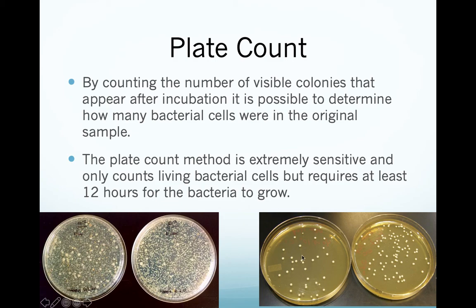So eventually you just do the back steps of math to figure out how many were in your original liter sample. This takes forever. It's a very easy way to mess up what you're doing if you're not precise about it. It's very easy to miscount. Lots and lots of problems can be encountered with this. It takes 12 hours per plate for the most part, so I hope your patient has time to wait. But if you're doing environmental samples, the environment can wait a couple of days.